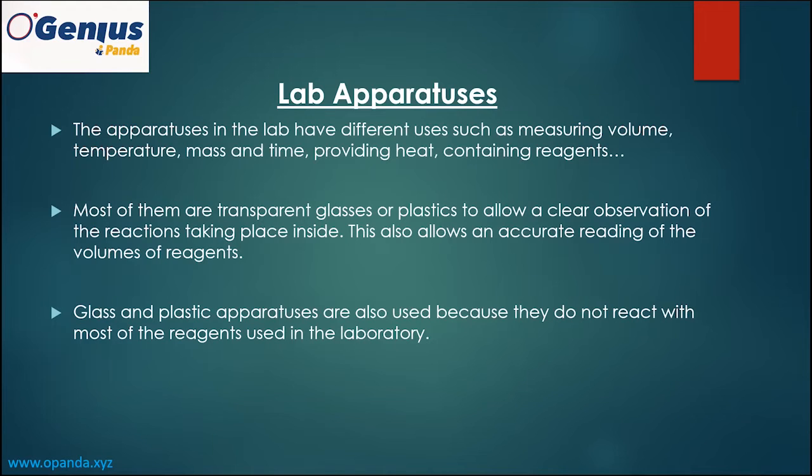It is also necessary for the containers to allow an accurate reading of volumes. You have a container with a substance inside, and you should be able to accurately read the volume of the solution inside the apparatus.